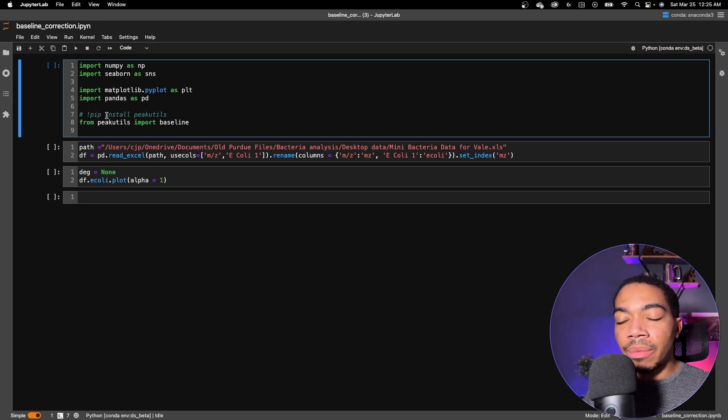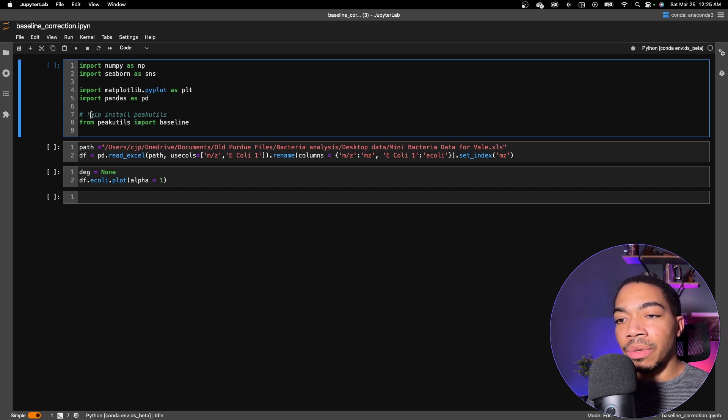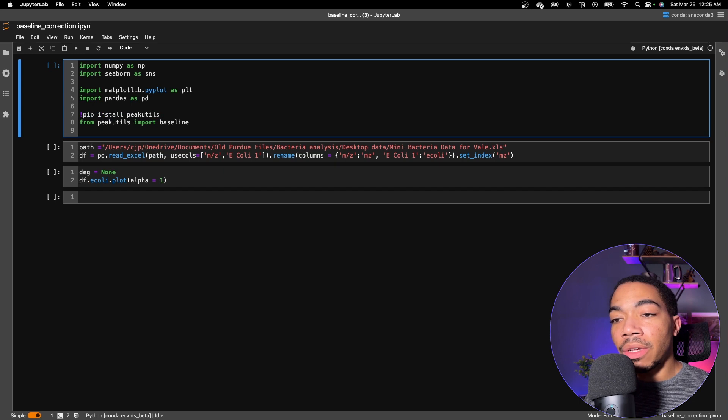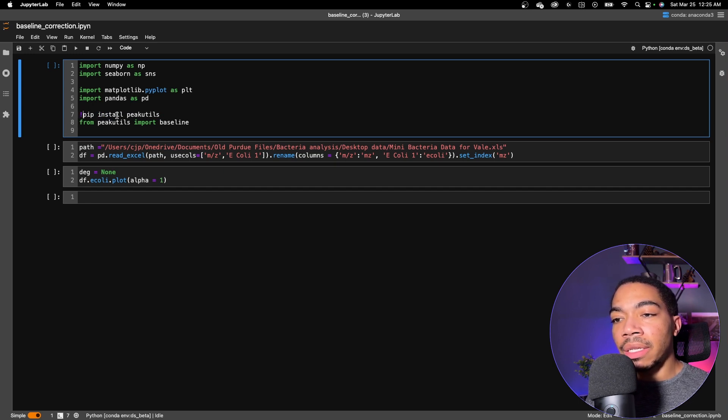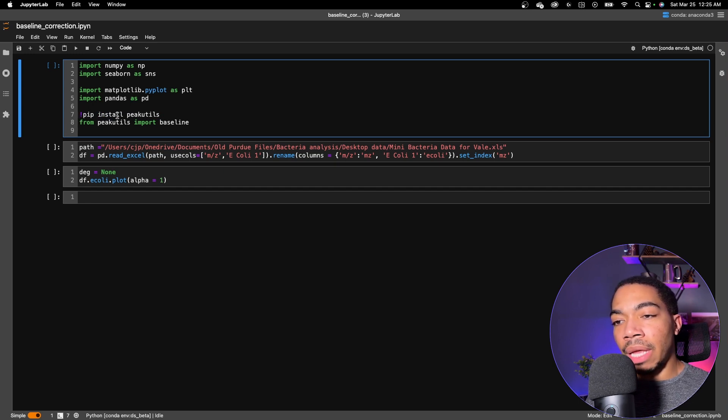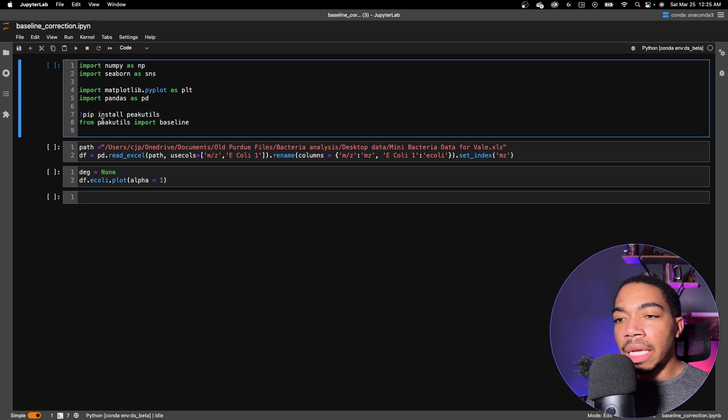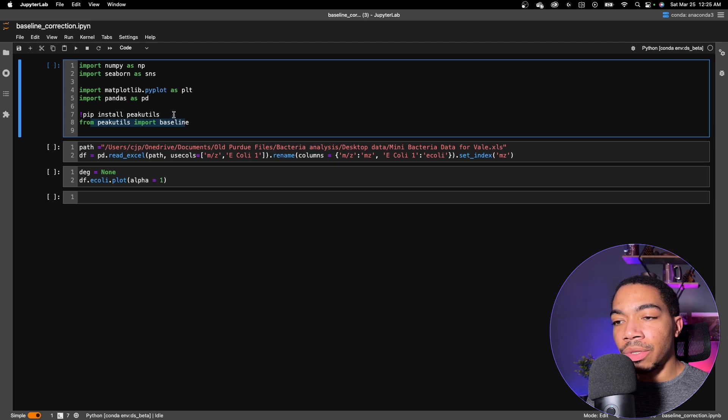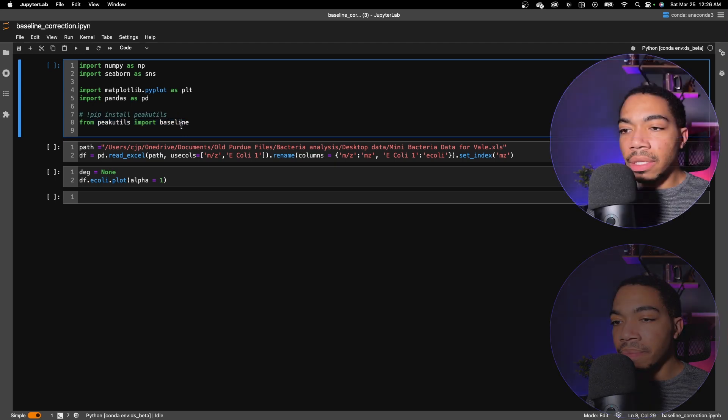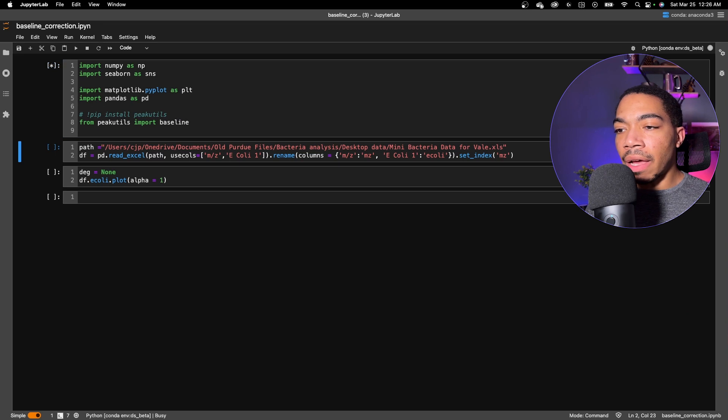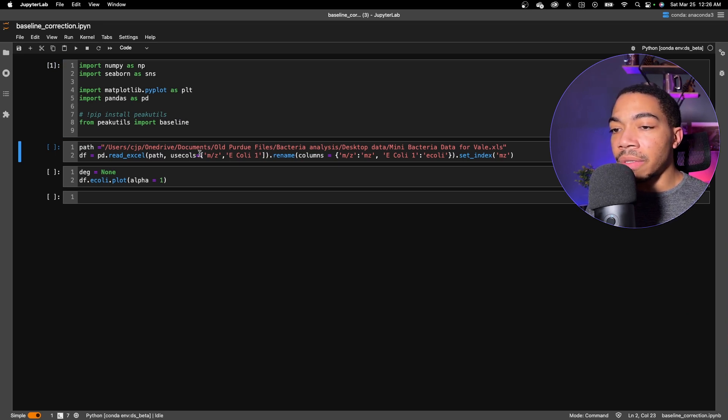Notice here that when I first ran this, I had to install peakutils. I did that using the exclamation point. And so if you don't have it in your environment, you could run this shell command and it will actually run in the terminal, install peakutils into your environment, and then you can import it using the usual syntax. The data can be found at this path here. This again is some old data I have from Purdue, and then we'll turn it to a data frame.